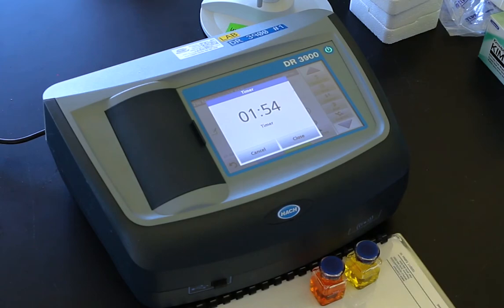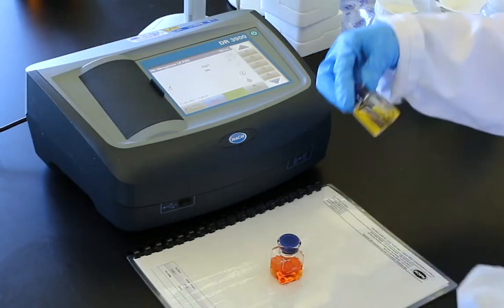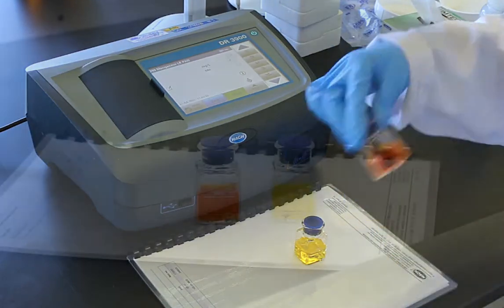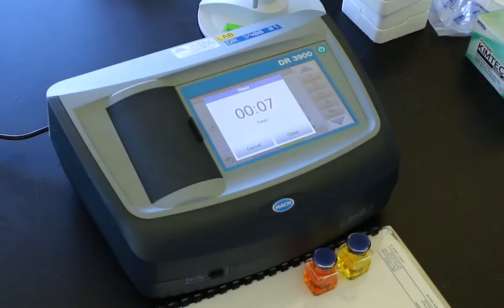Start a timer for two minutes of reaction time. While the timer is going, clean the outside of both cells. When the timer expires, align the blank cell into the instrument as indicated by your manufacturer.